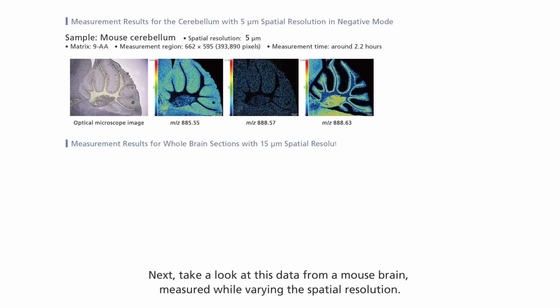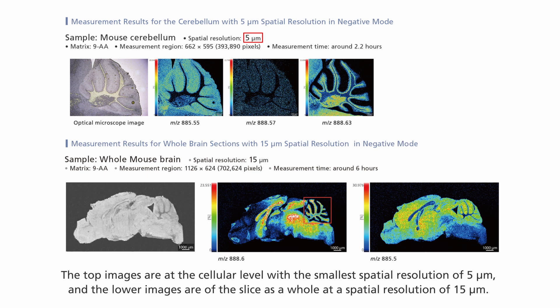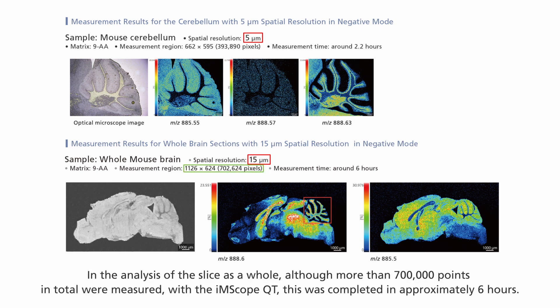Next, take a look at this data from a mouse brain, measured while varying the spatial resolution. The top images are at the cellular level with the smallest spatial resolution of 5 micrometers, and the lower images are of the slice as a whole at a spatial resolution of 15 micrometers. The spatial resolution of the MS images can be adjusted according to the aim of the analysis. In the analysis of the slice as a whole, although more than 700,000 points in total were measured with the IMScope QT, this was completed in approximately six hours.